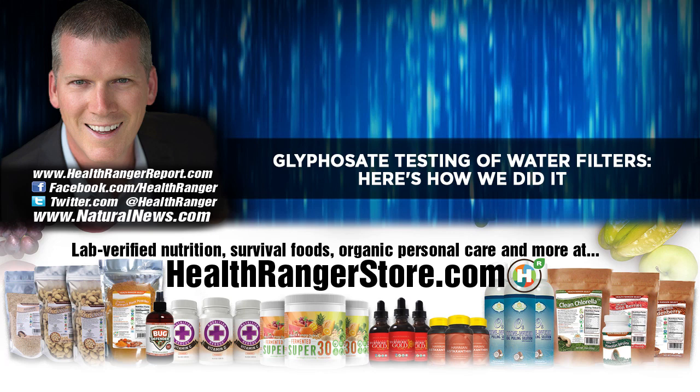It's better than anything in the scientific literature. So we're going to publish this paper, and first we're going to write it up. We're just starting this process right now of gathering all the final data to write up the paper. We're going to submit the science paper to various scientific journals and get it published, just like I've been published before. And we're going to publish this paper on this really robust, incredibly linear, astonishingly replicable glyphosate quantitation chromatography mass spec procedure. It's really a big deal. And I mean, no wonder it took us over 2 years to get this nailed down. The complexity of it is insane.